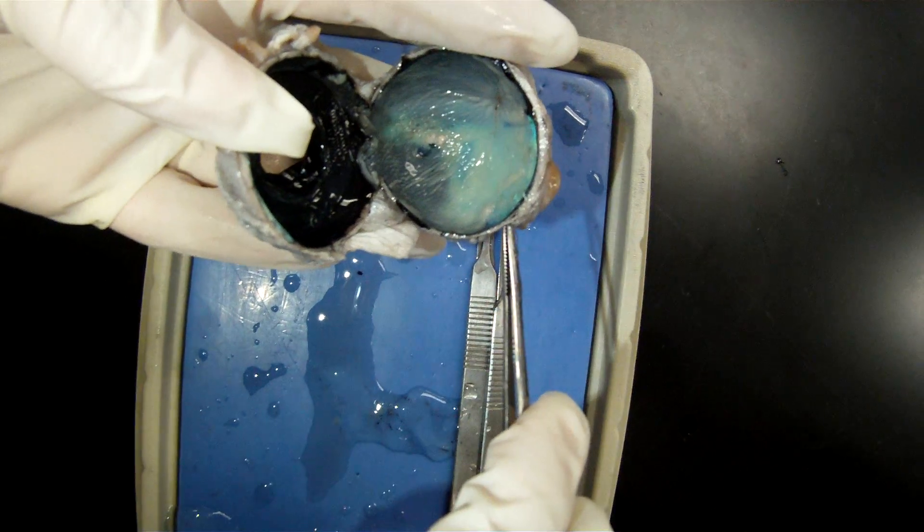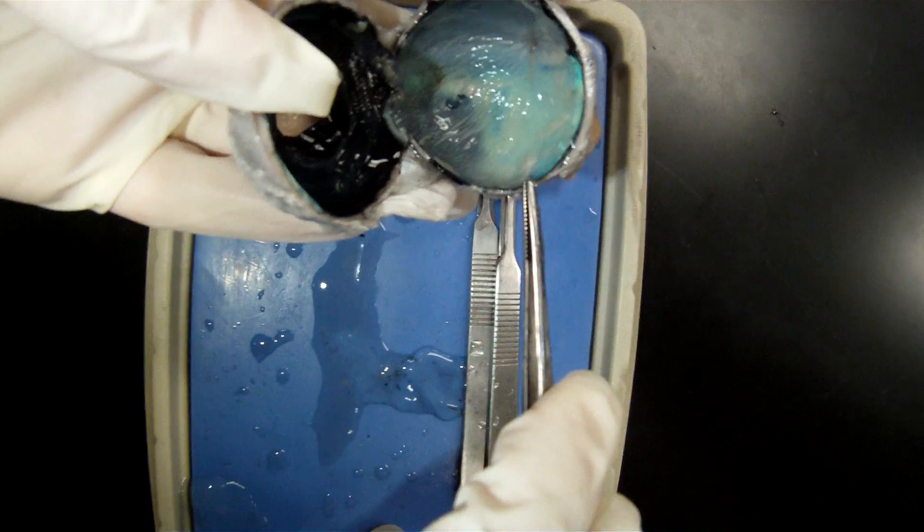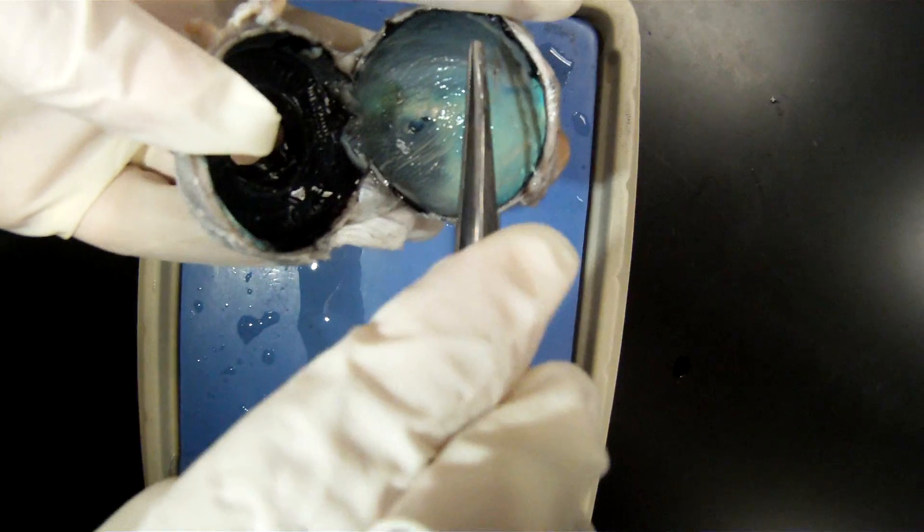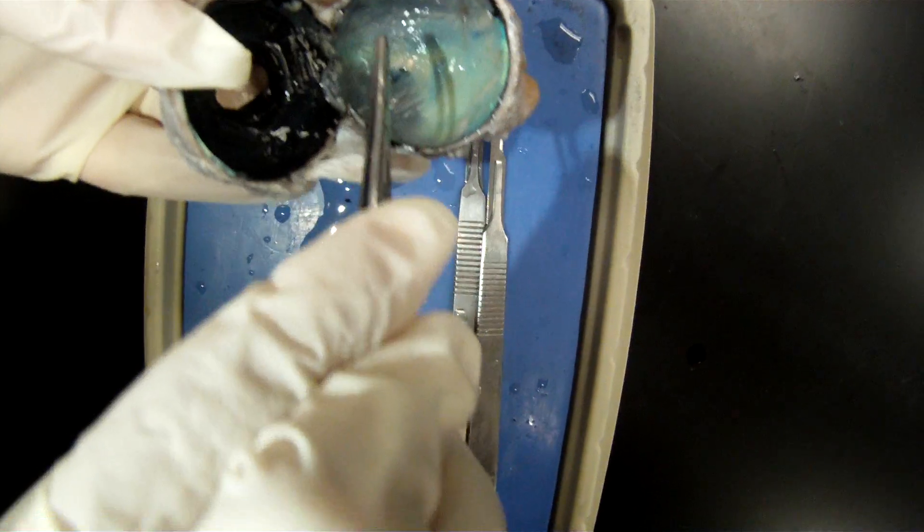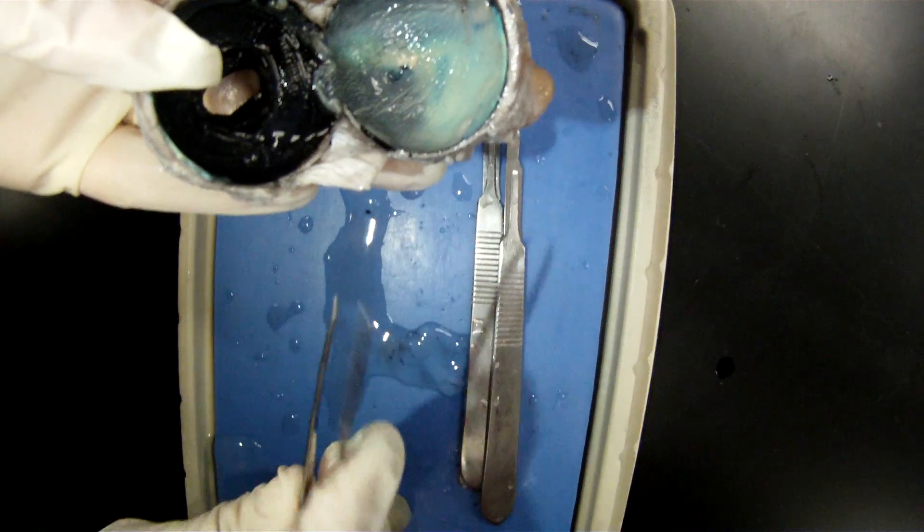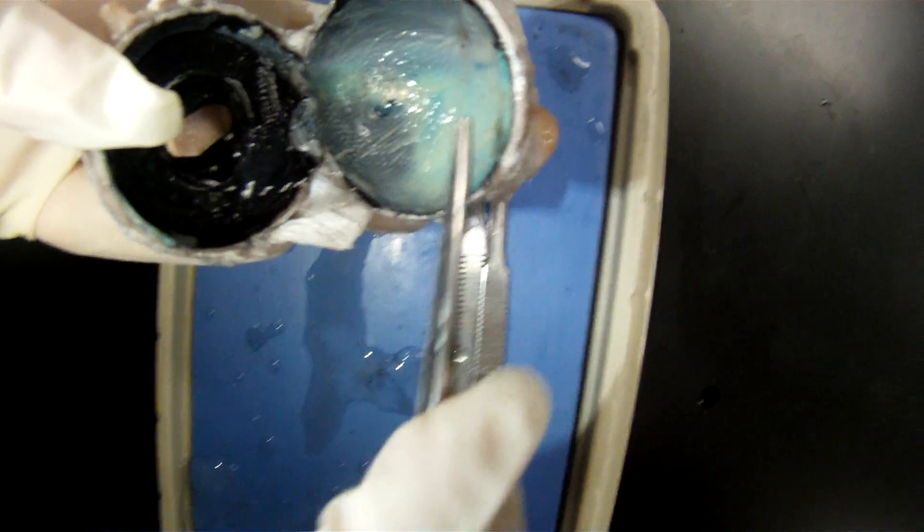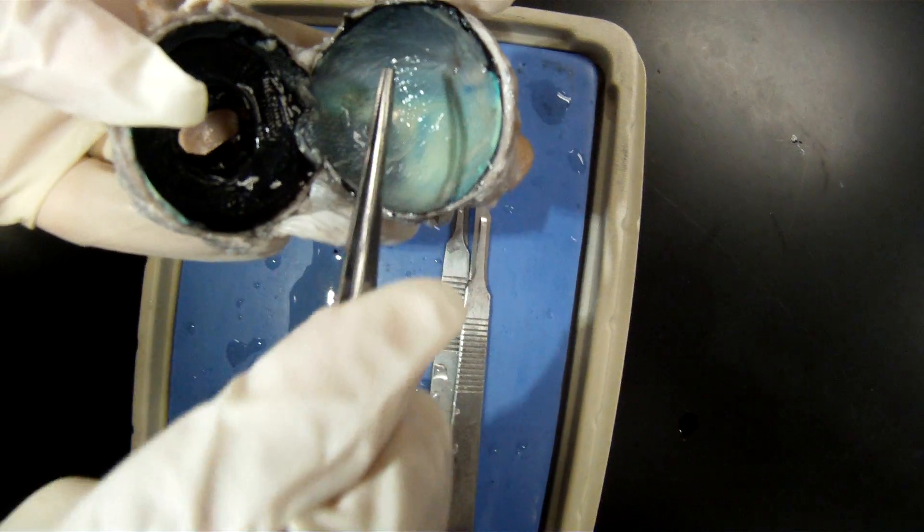This is the sclera. The black is the choroid, and the membrane that is still intact is the retina. So most superficial, we had the sclera, and moving deeper, we had the choroid, and deeper to that was the retina.